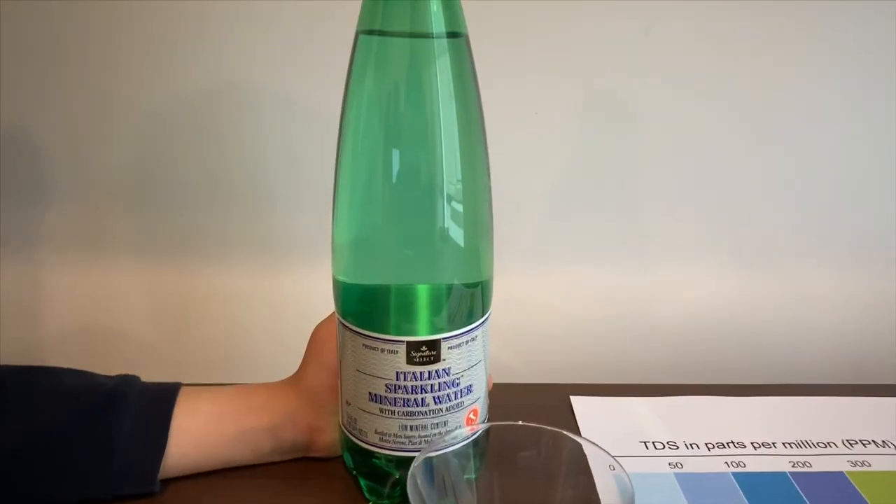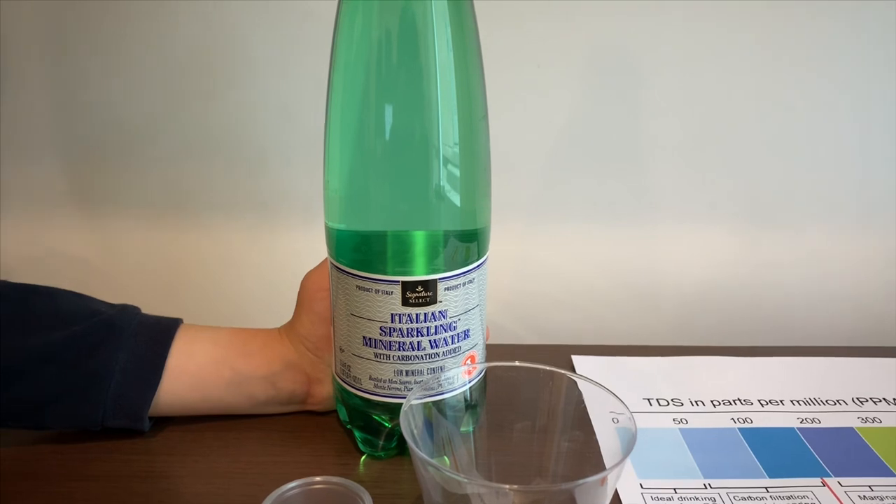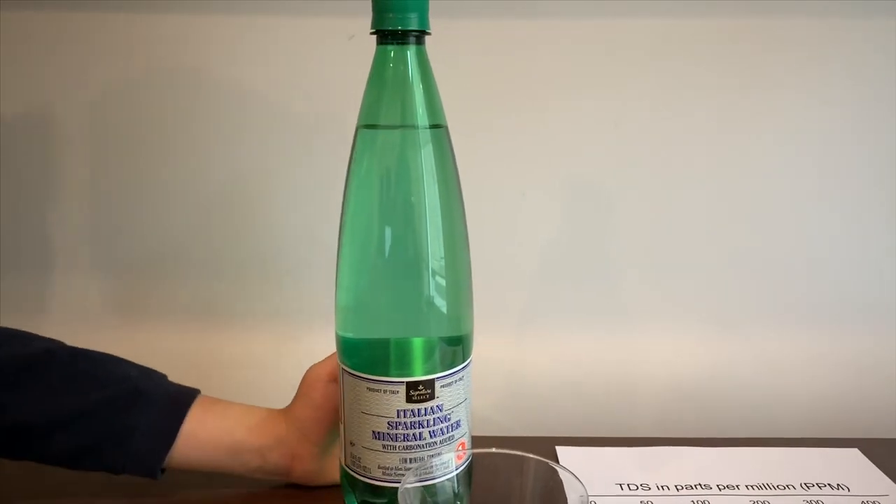This is Signature Select Italian Sparkling Mineral Water. It's sourced from Italy and it costs $1.49. Let's test the pH and TDS levels.